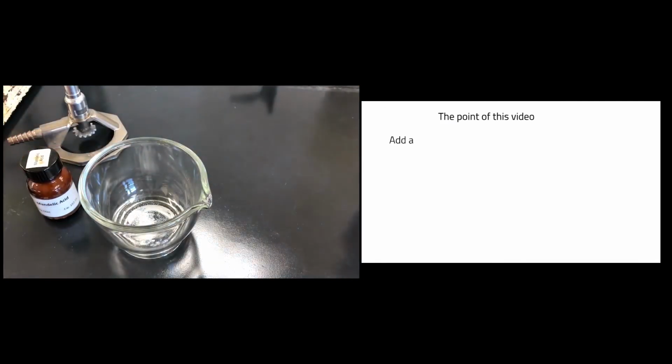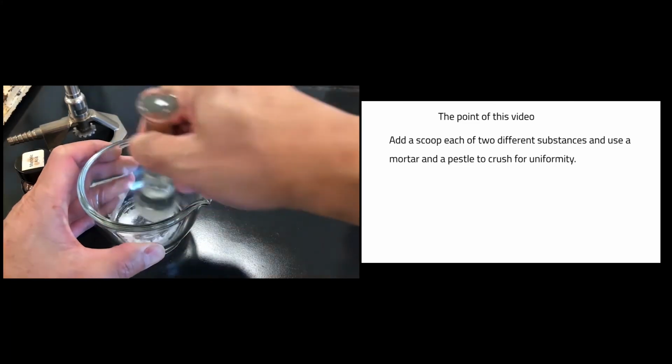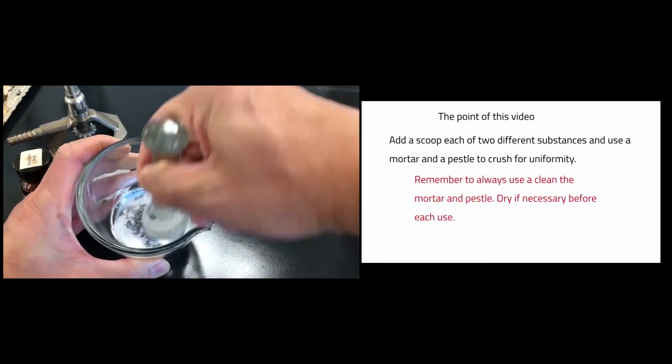The point of this part in the video: add a scoop of two different substances and use a mortar and pestle to crush for uniformity. Remember to always use a clean mortar and pestle, dry if necessary, before each use.